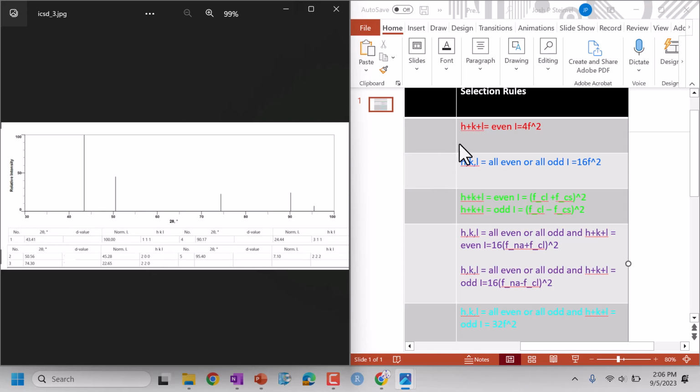So, h plus k plus l has to be even for BCC. 1 plus 1 plus 1, that's 3, dead. Doesn't work. For FCC, all even or all odd. So these are all odd, all even, all odd, all even. So this is a candidate, for sure.